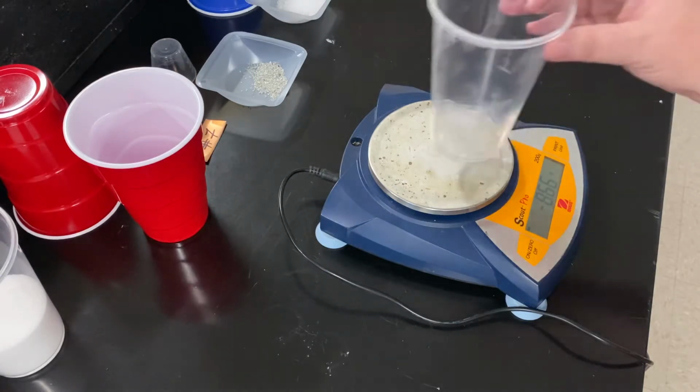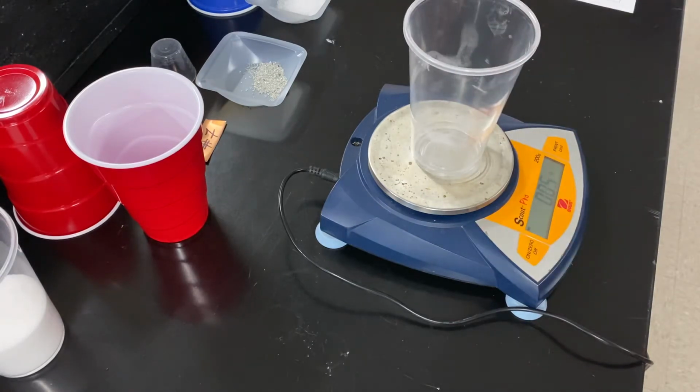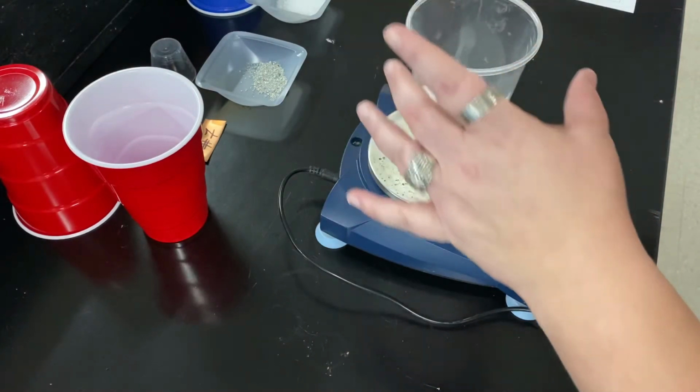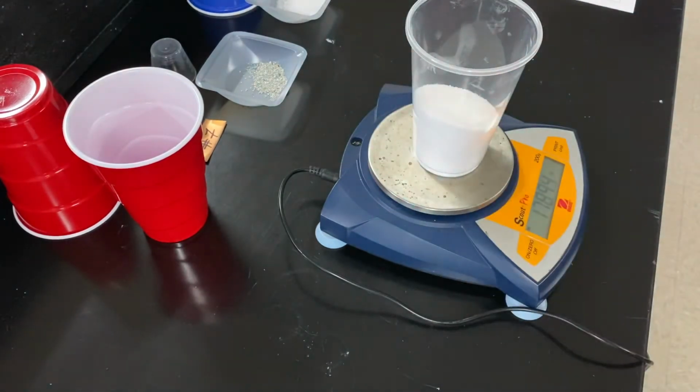NaCl. So I'm going to put a plastic cup, I'm going to zero it out so it's not considered in the mass. Now I'm going to add my salt. This particular sample has a mass of 179.95 grams. So I want you to do this to 3 sig figs. So we're going to use 179 grams. 179 grams of salt for task A.